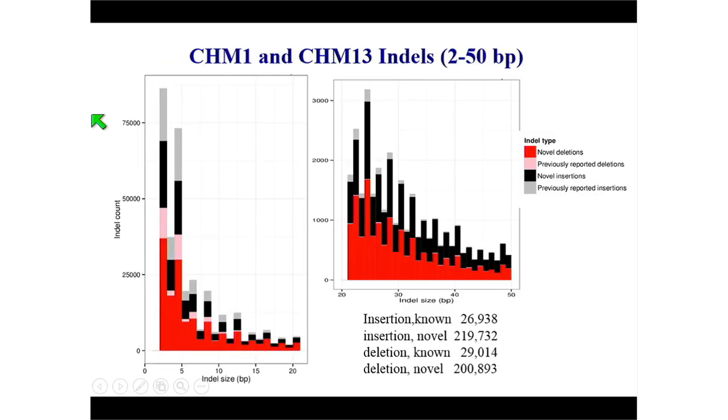And I'll just make a shout out also for indels, even though this is not an area that we have focused on in our lab. With these long read sequencing technologies, we can now detect insertions and deletions, particularly where technologies like Illumina with GATK or FreeBayes drop off.